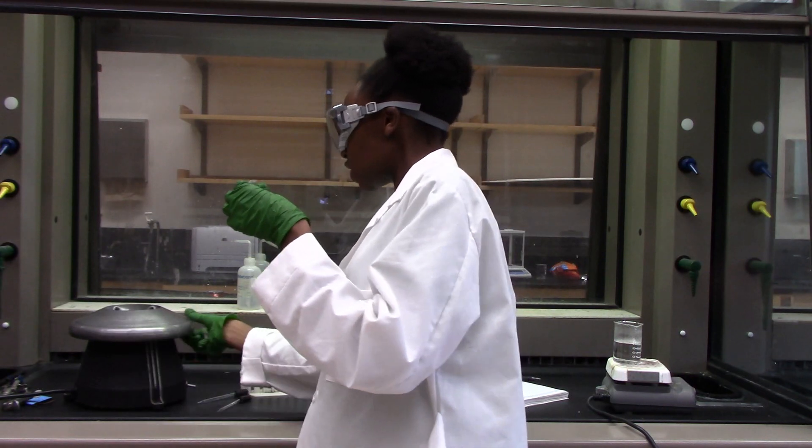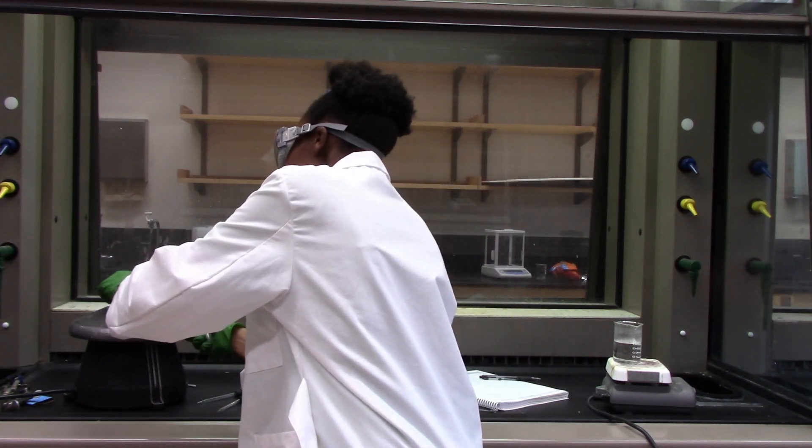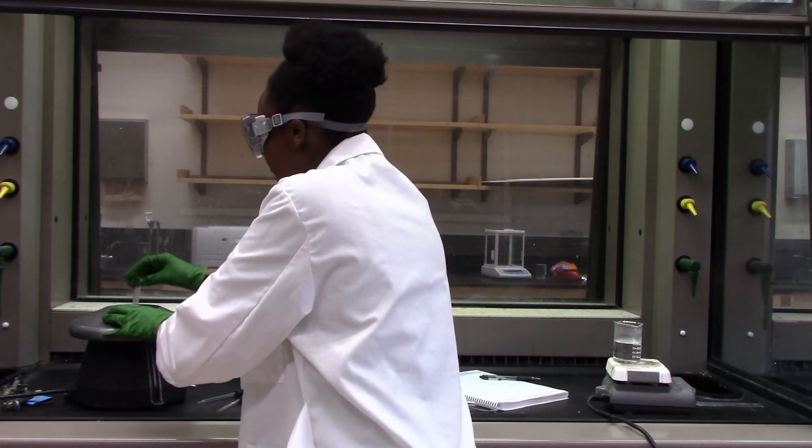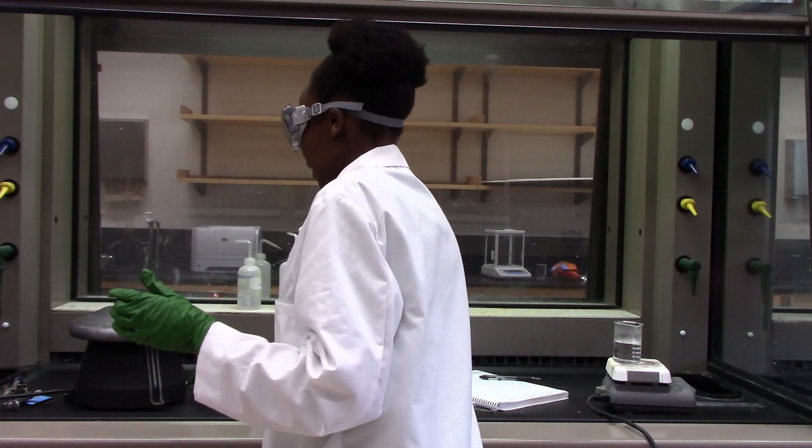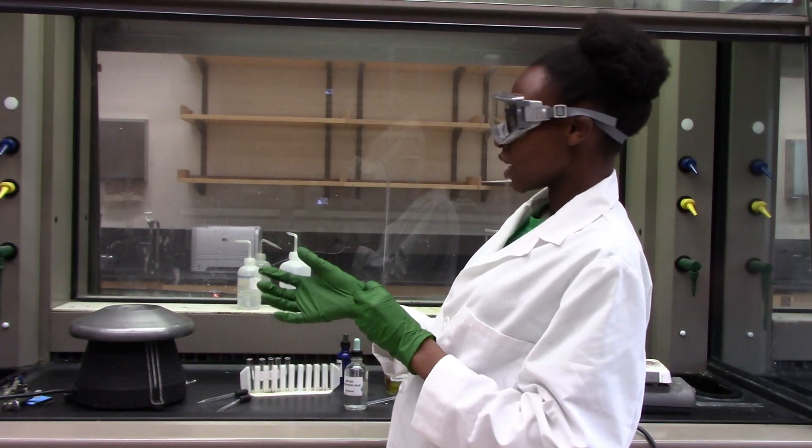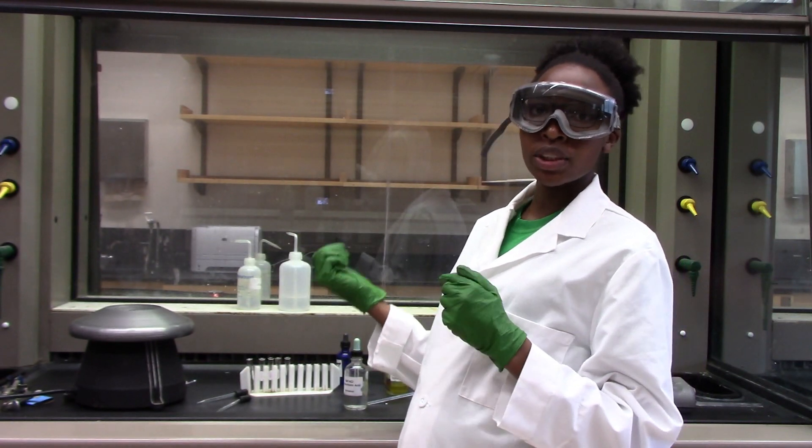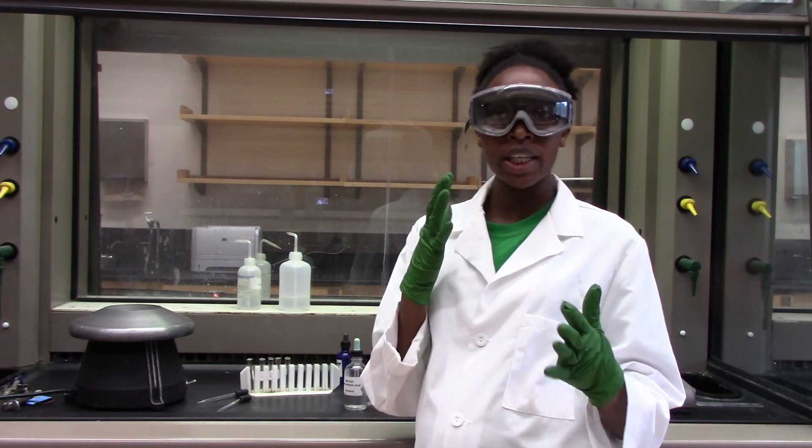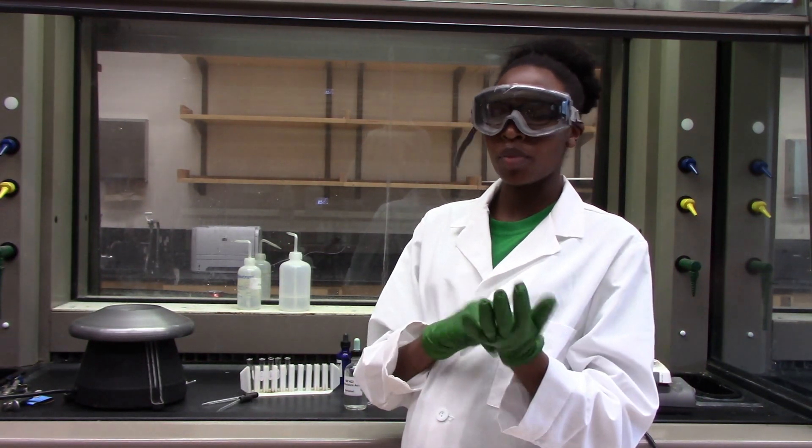I am using a stirring rod to mix and make sure that I have a uniform mixture. Then I will centrifuge. This is my centrifuge right here. I just put in and I balance it. The centrifuging should help us separate the precipitate from the supernatant.